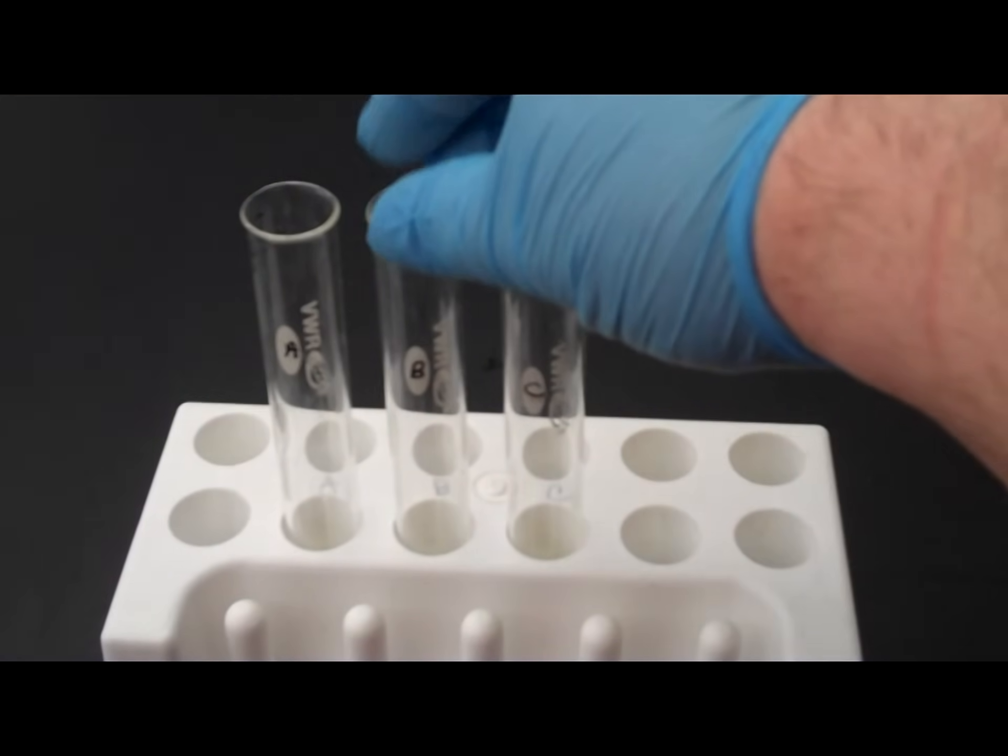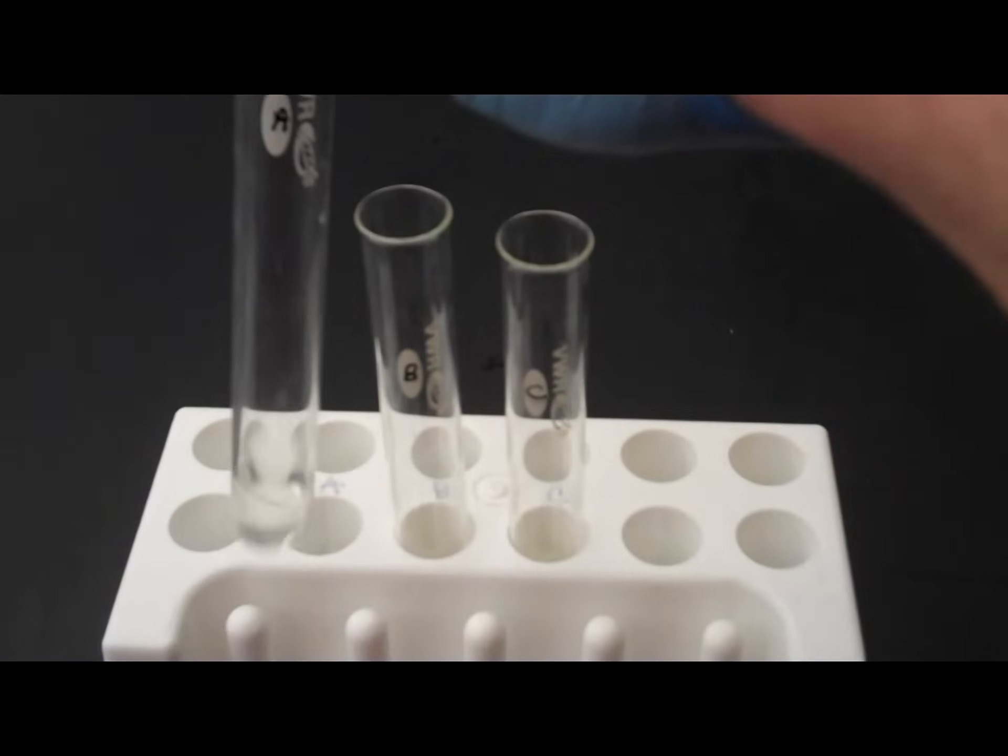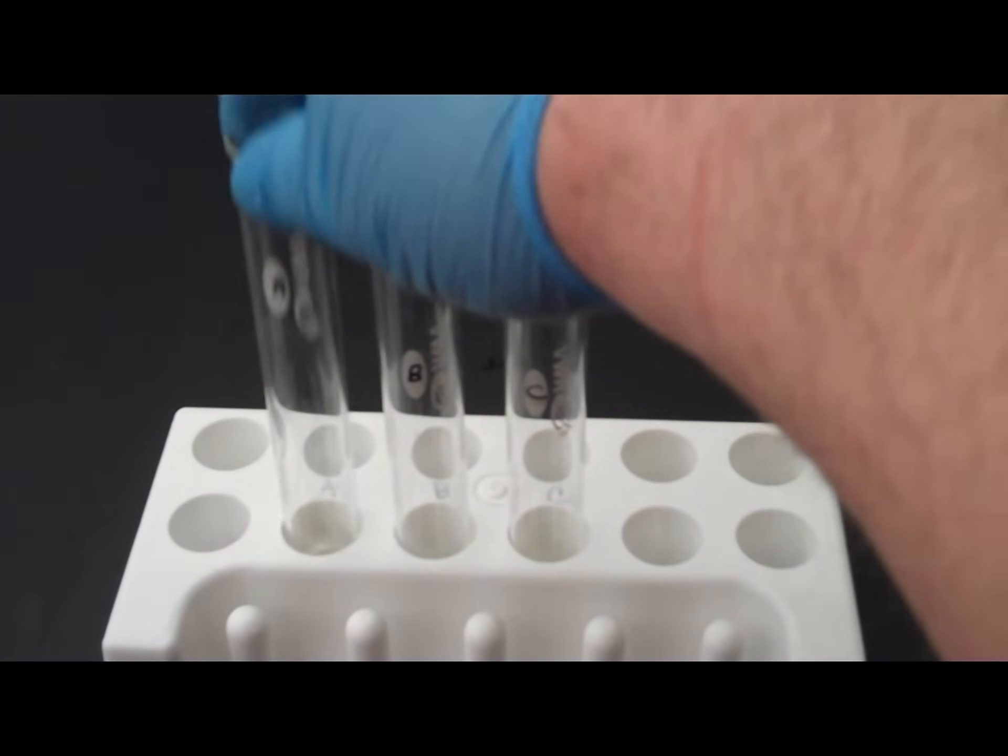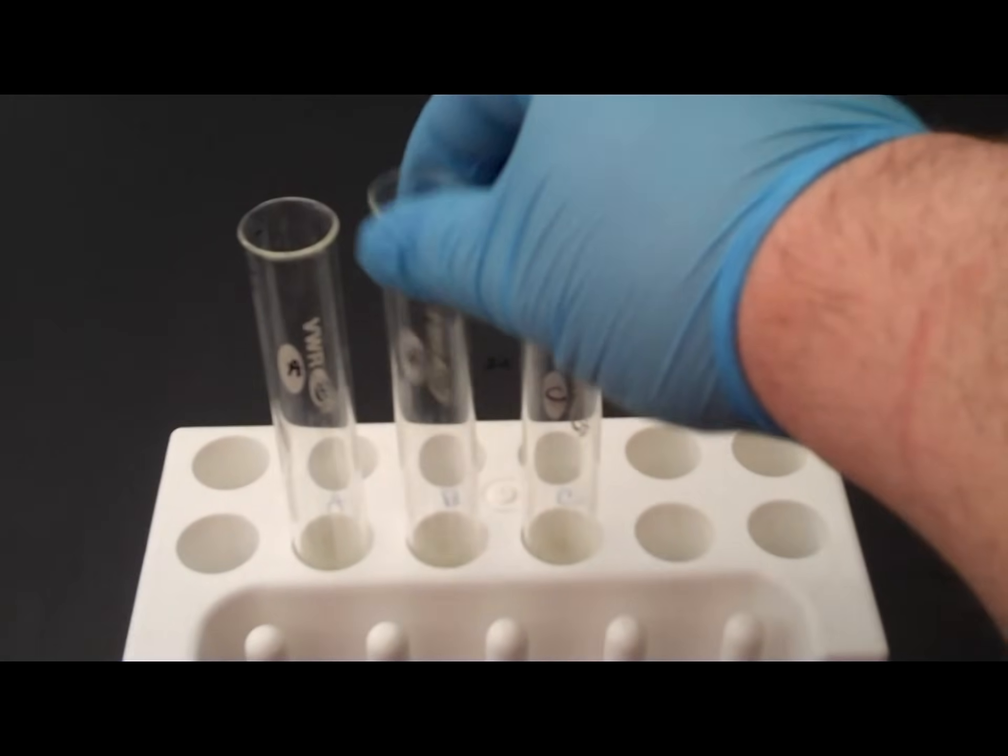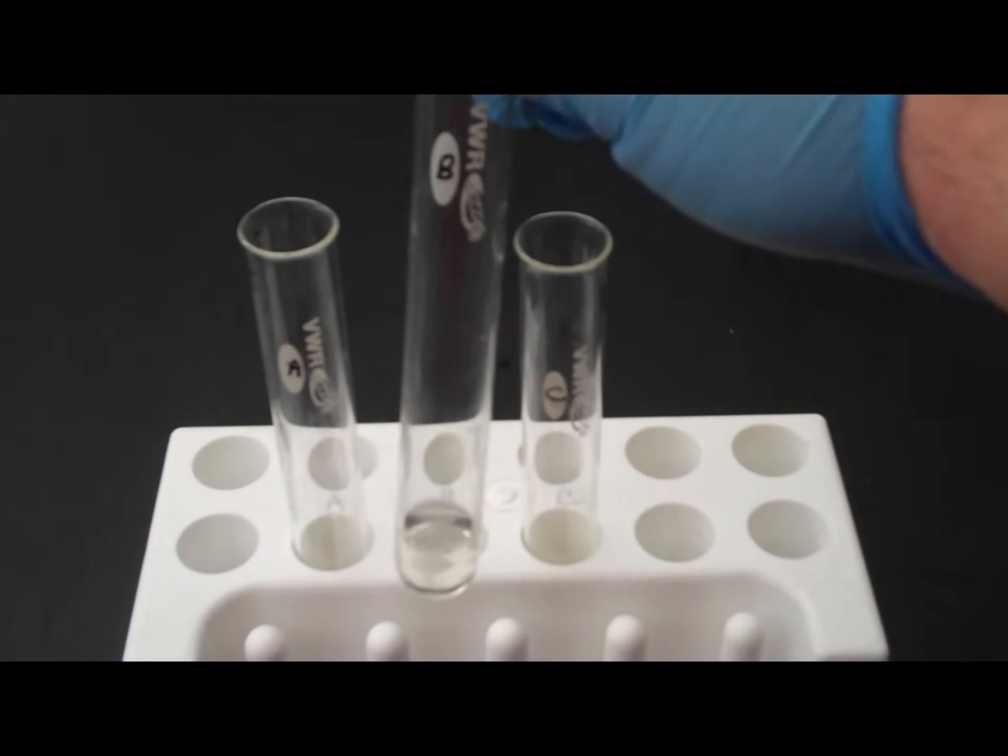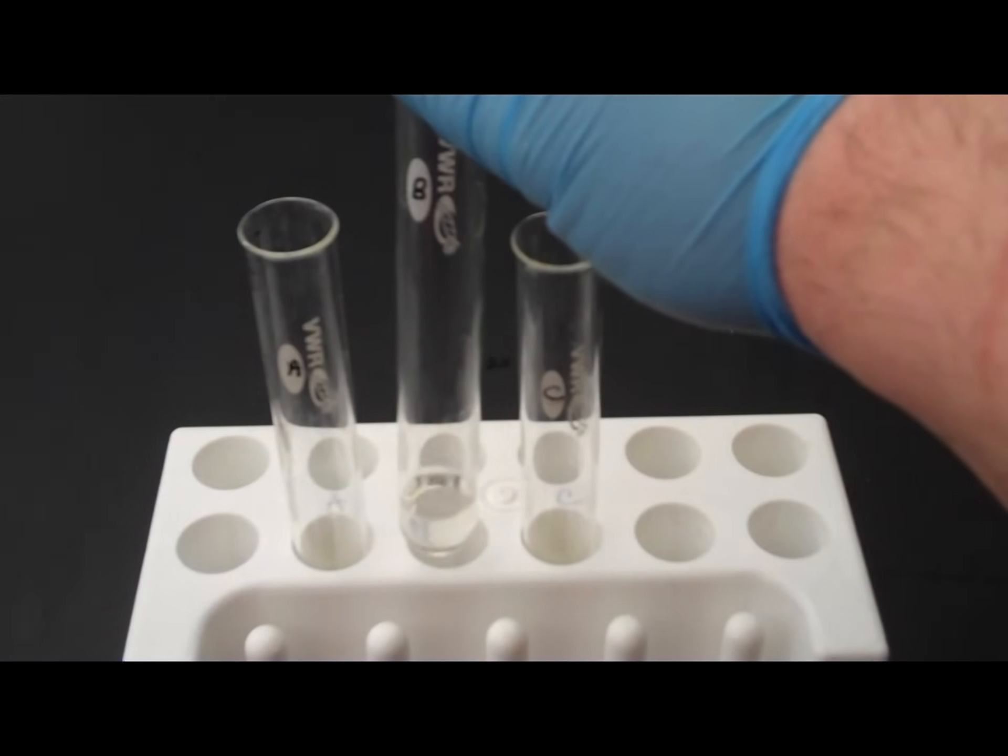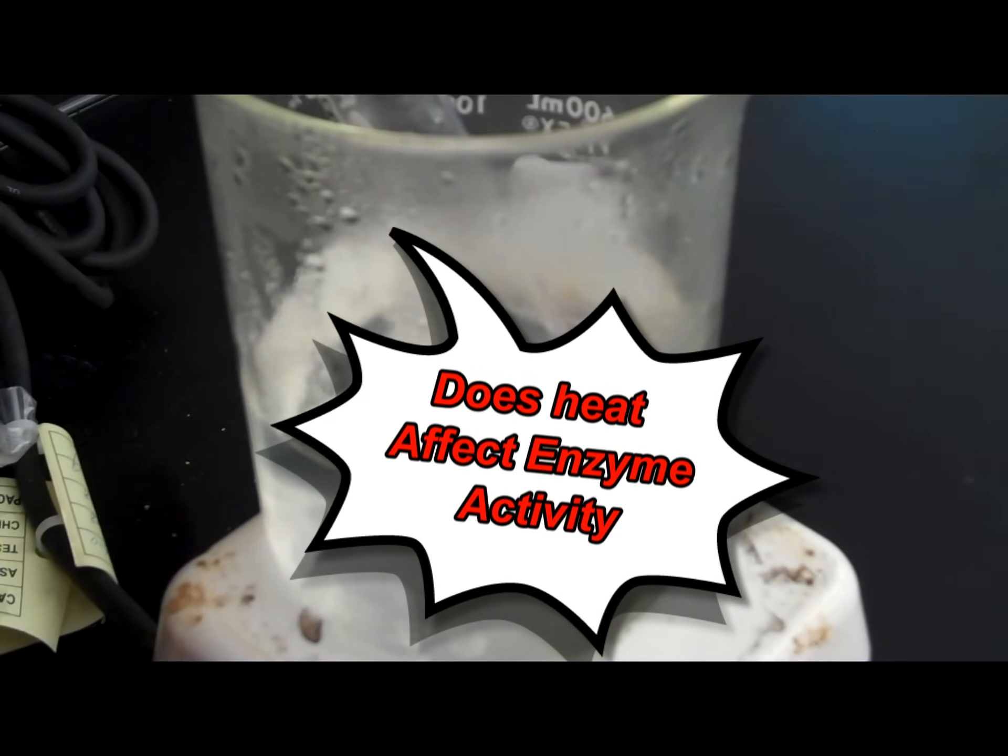Okay. So, now I'm going to put test tube B. So, in test tube A, we put vinegar, which is an acid, and amylase. In test tube B, we put amylase and distilled water. So, I'm going to take test tube B and put it under high temperature. And so, we're going to let this boil in this test tube for about 10 minutes or so to let that enzyme really break down.